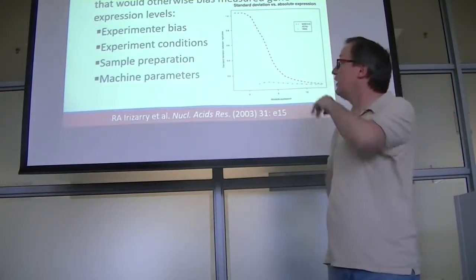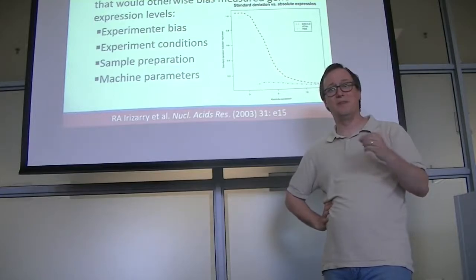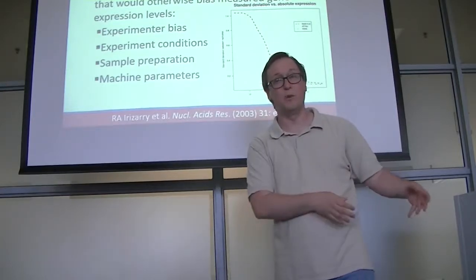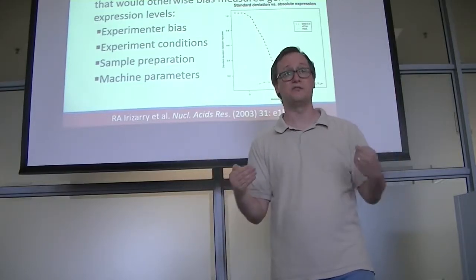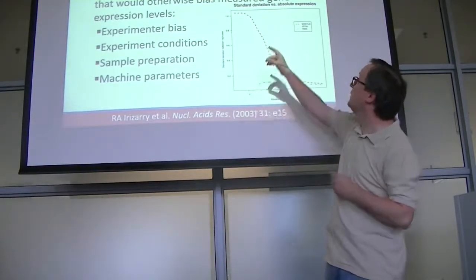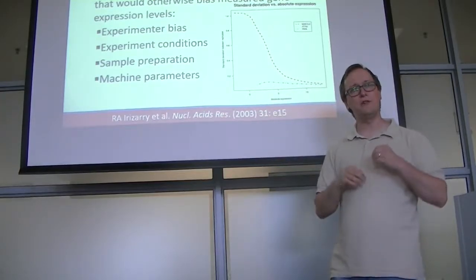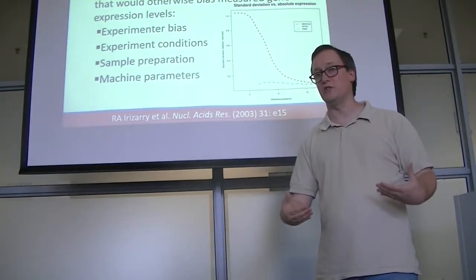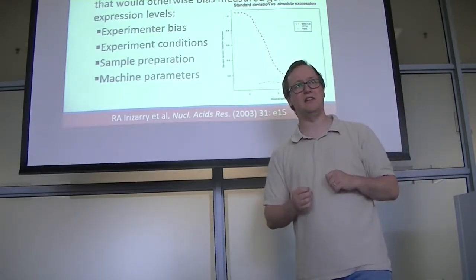All right, so let's start with normalization. There are lots of reasons why you might observe systematic differences between an experiment run today and an experiment run, for example, next week. Some of these things can really interfere with your ability to compare the results from last week with the results from today. We would call that a batch effect. But for now, let's talk about normalization. We know that some systematic variation exists among our data sets. Rather than mislead ourselves into thinking these differences are biological in nature, it's appropriate for us to try to remove this systematic variation before we get to the place of biology.